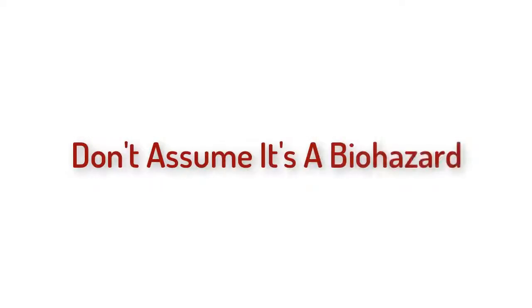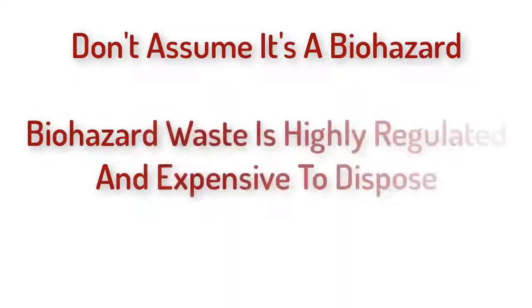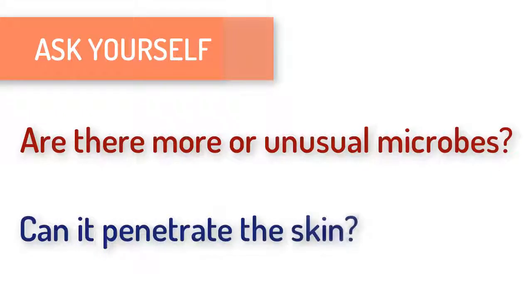When in doubt, do not assume the item you are disposing of goes in an infectious biohazard container. In a clinical setting, infectious or biohazard waste is highly regulated and expensive to dispose of. Instead, when in doubt, ask yourself first these 2 questions. Are there more or different microbes on the item that you are disposing of than on a normal item? And can this item easily penetrate the skin?